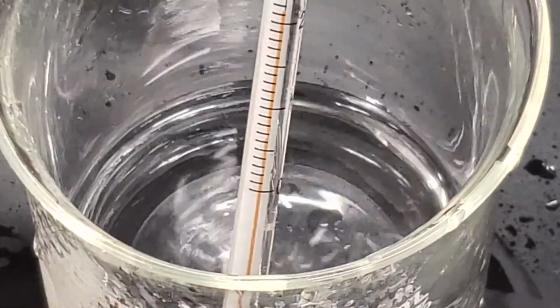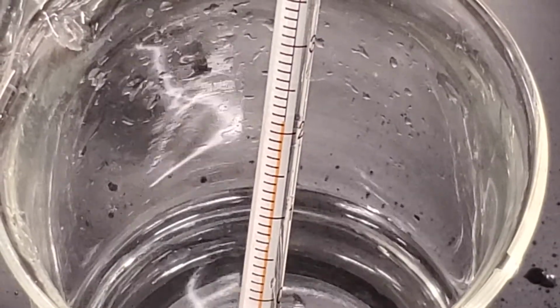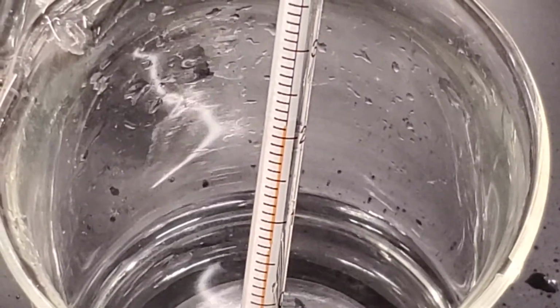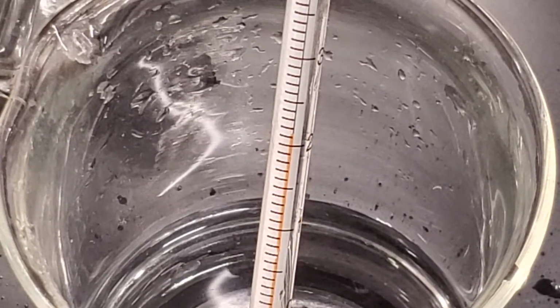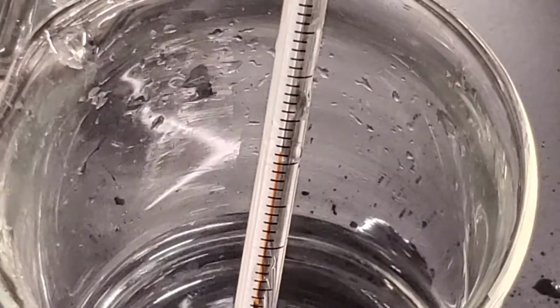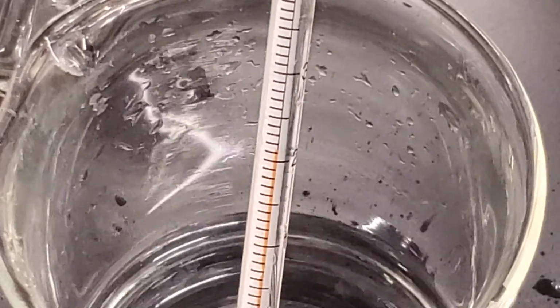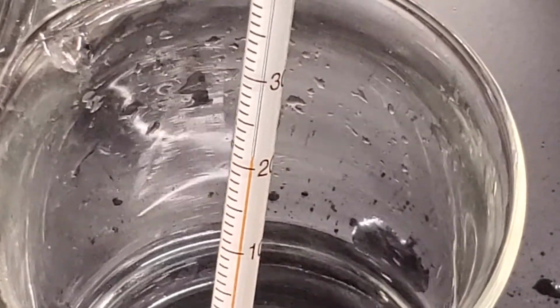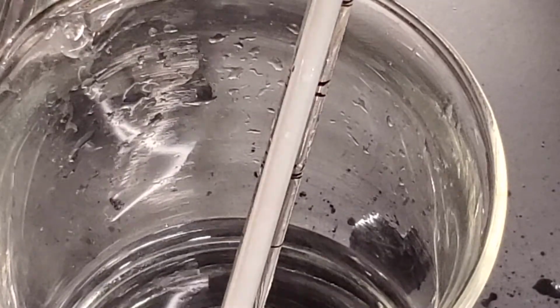You know what? I wonder if that's in a warm spot. Oh, it's not too bad. I was worried that I was manipulating the temperature a little bit by having it in a spot on the table that was slightly warmer. All right, so we'll go ahead and call that. Again, like we've seen before, there's the 20-degree hash mark, and it's still relatively close to that first short hash mark. So make sure that you record that next to the ammonium chloride and water starting temperature.